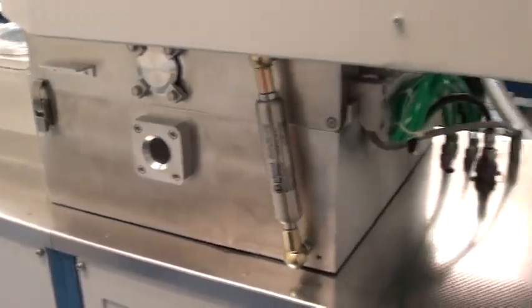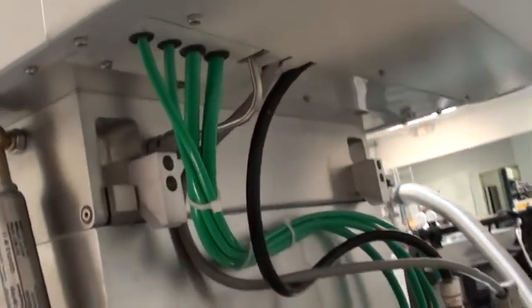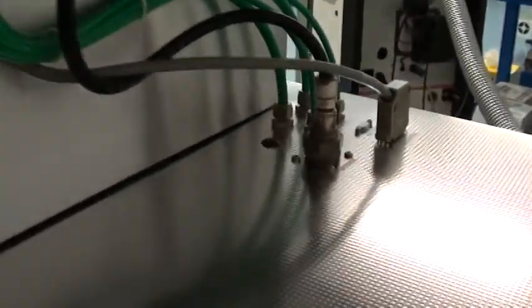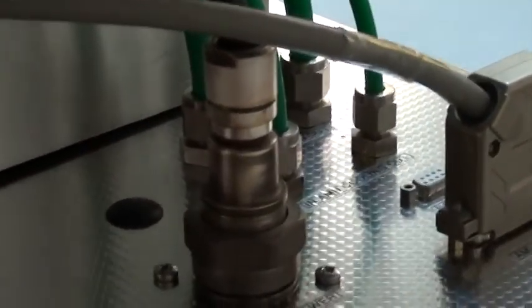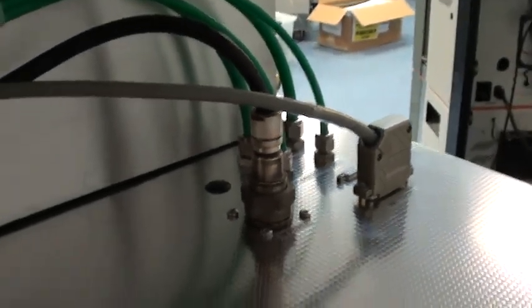Side glass windows. O-rings here. All wiring, plumbing, tubing has been either checked or replaced. If it showed anywhere, it has been replaced.